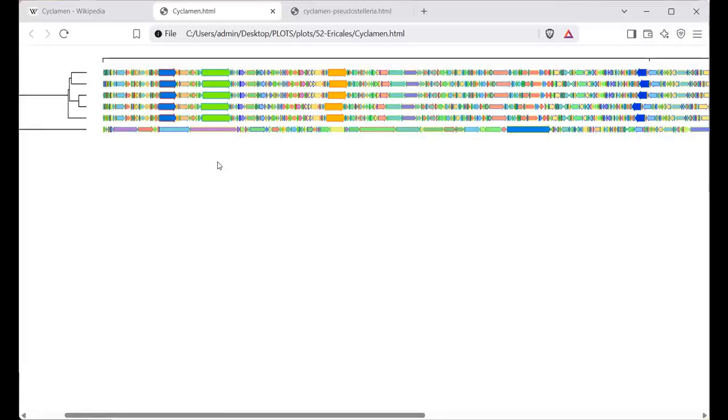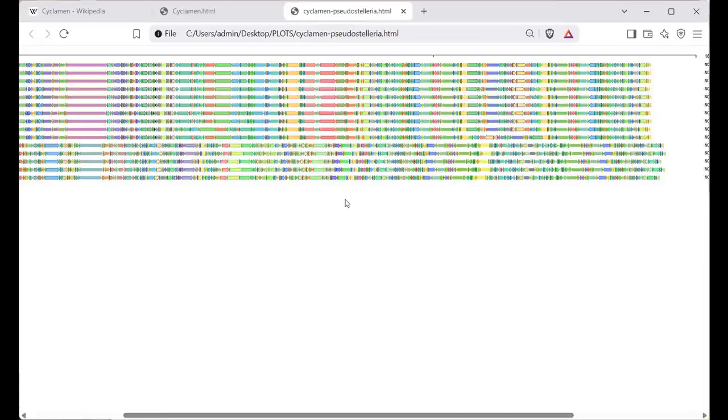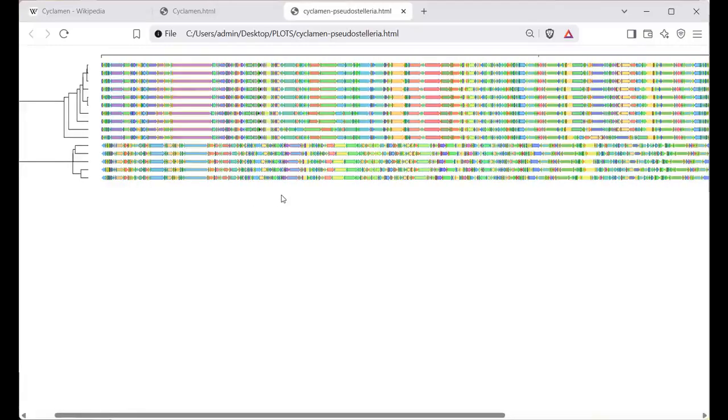I took a portion of the sequence, searched at NCBI, and then whatever the NCBI result gave, I ran BLAST or PGR-TK with both sets combined. And in a large number of cases, I'd say 80% of the cases, it turned out to be incorrect annotation for the plant.